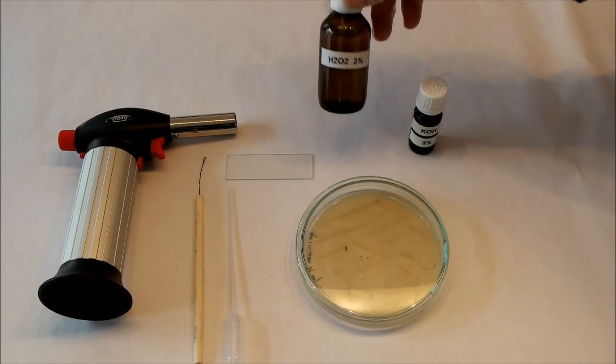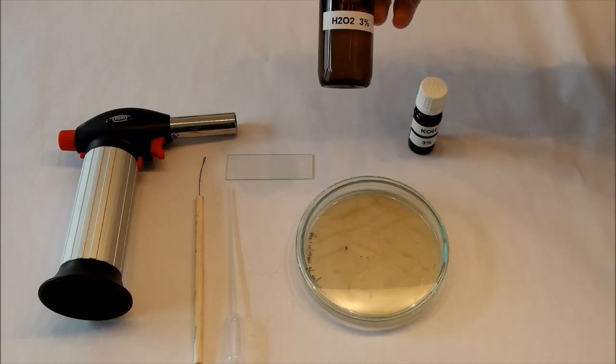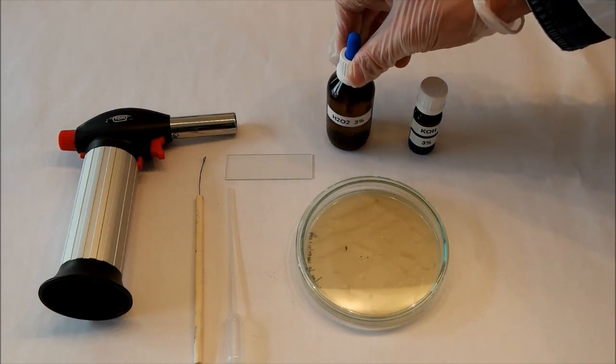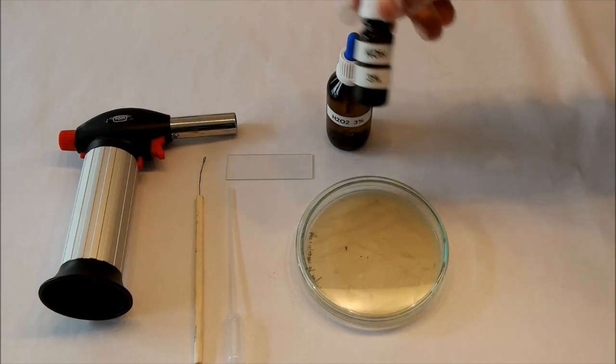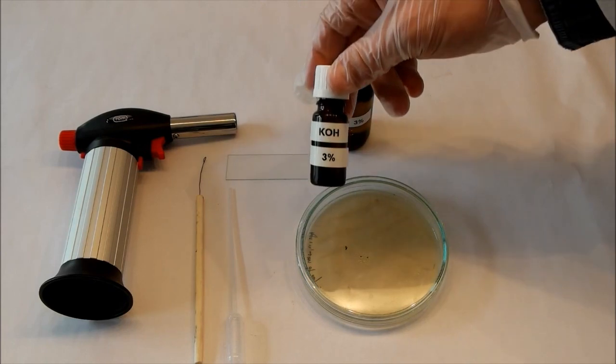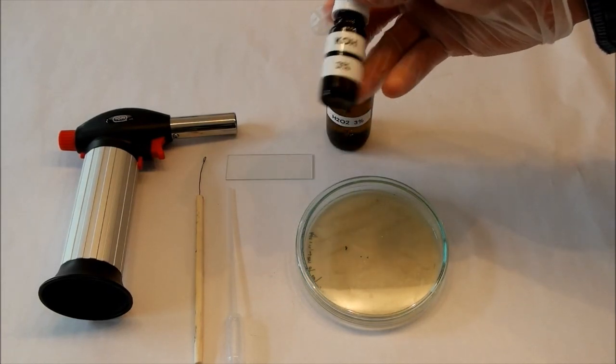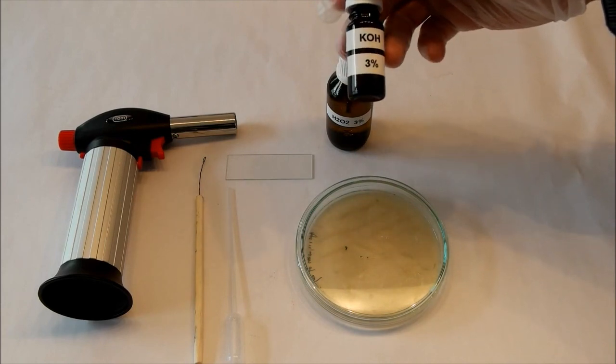The first one is a catalase test. For that you need a 3% solution of hydrogen peroxide, and the other one is the potassium hydroxide preparation, for which we use a 3% solution of potassium hydroxide too.